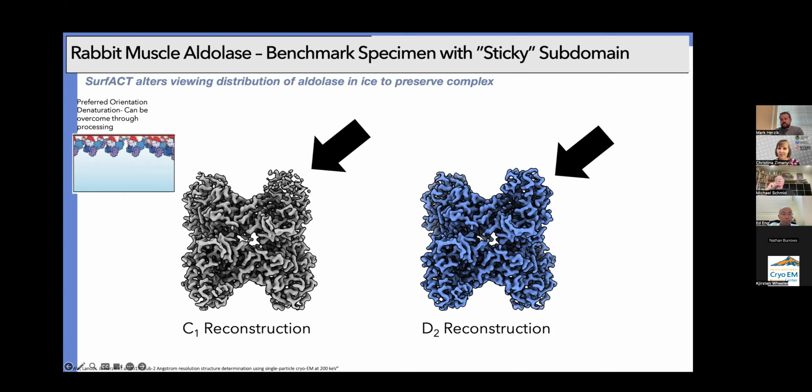And I think you kind of answered the question. The only way you noticed that is because you did the tomogram and you saw which part of the protein was up or down, and that was the part that was denatured. So all other things being equal, it was because it was at the air-water interface, because that's the way it was pointed. But you don't get that usually except in tomograms, so it's hard to do any other way.